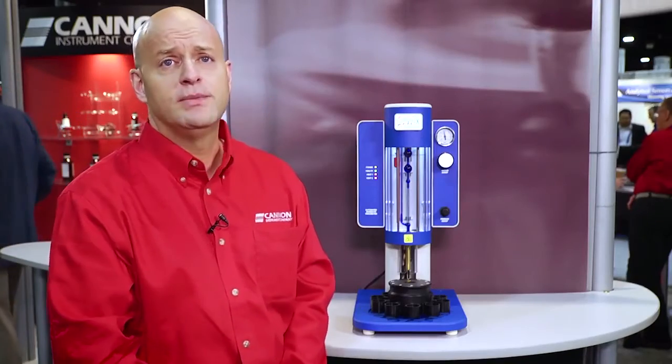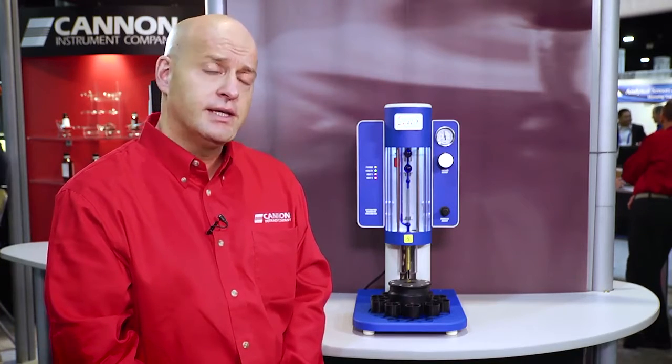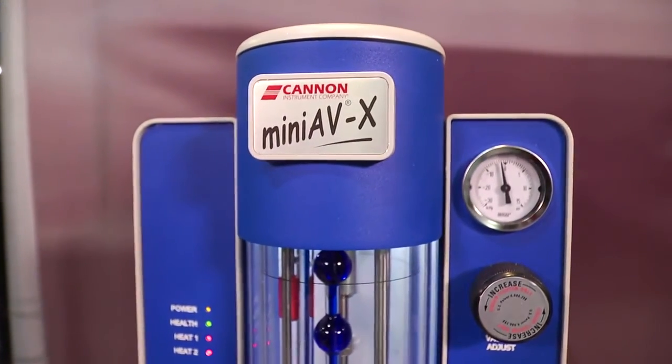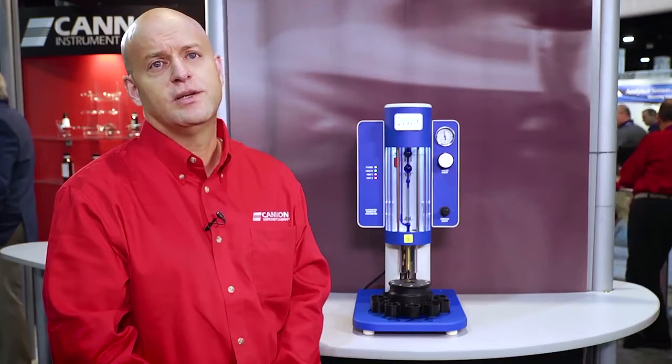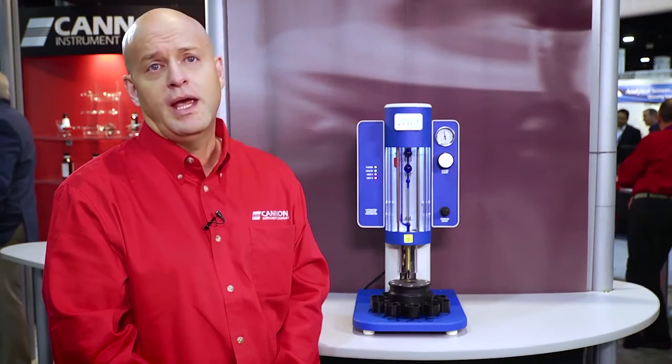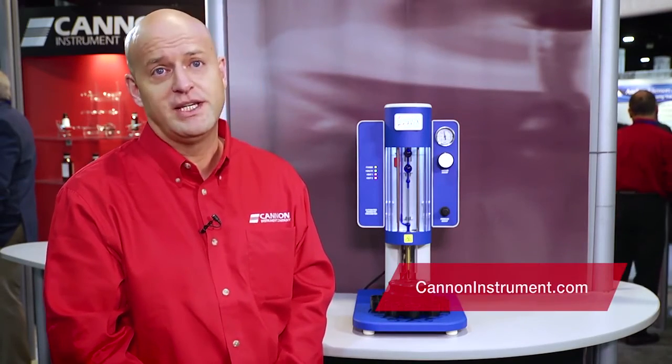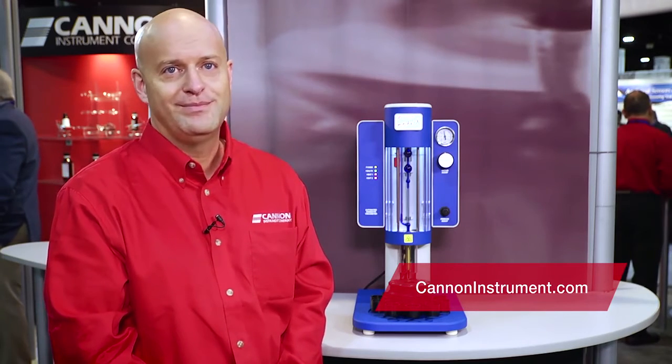The system comes fully turnkey with a NIST traceable digital thermometer, a full set of certified viscosity reference standards, sample vials, and solvent containers. The only thing the customer needs to supply is a PC and their samples and solvent. If you'd like to learn more about the Mini AVX automated viscometer, please visit CanonInstrument.com. Thank you.